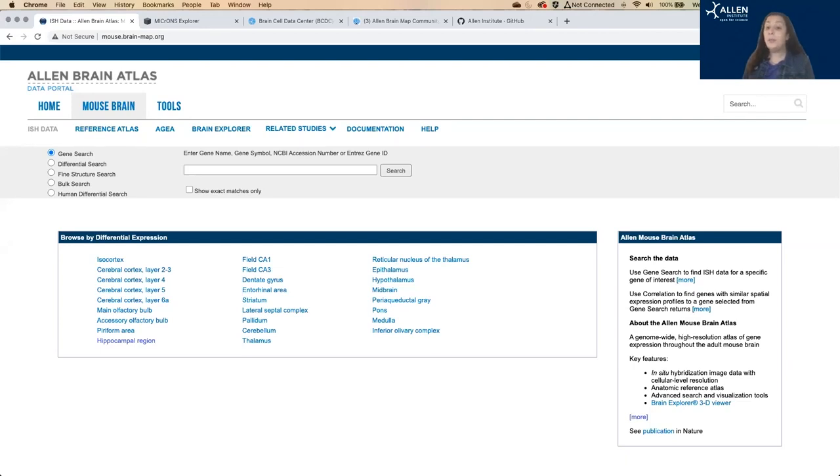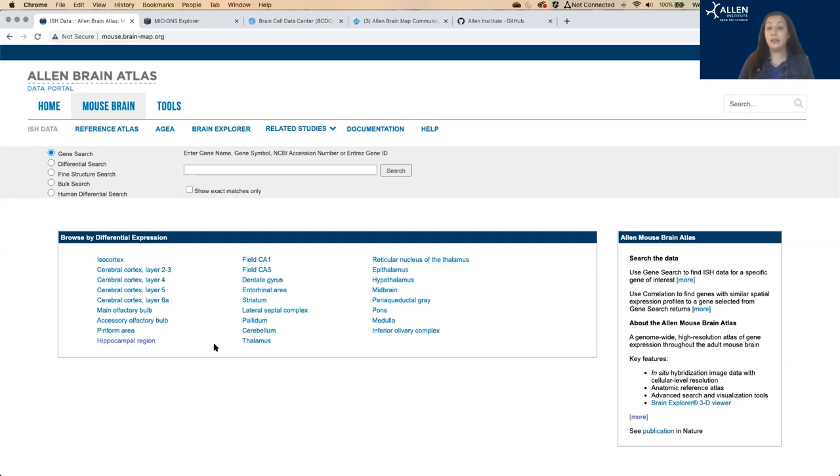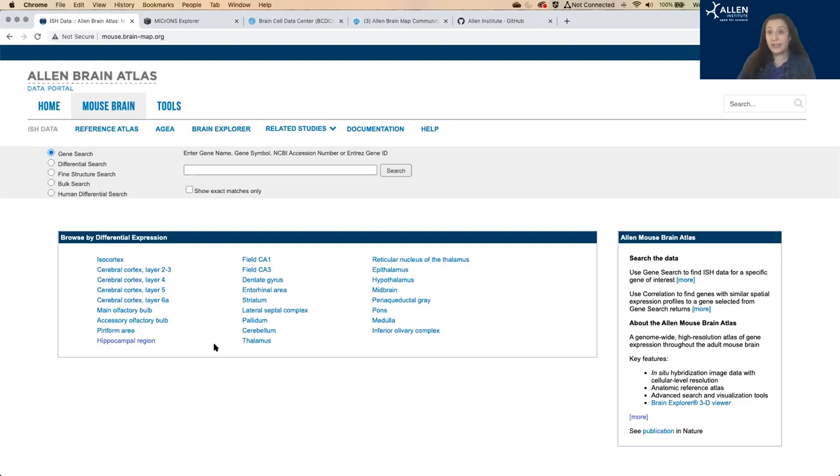You can look up gene expression for the whole mouse genome in the whole brain, and this uses in-situ hybridization, ISH, across mostly sagittal slices of the brain, showing the location and the relative amount of gene expression for all genes, one at a time, individually.